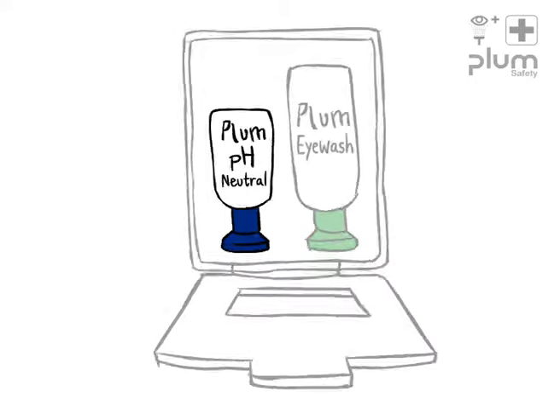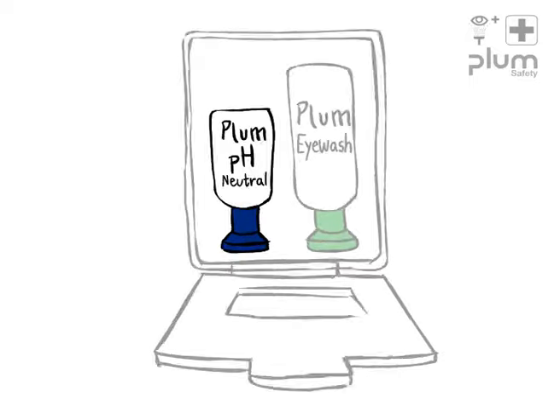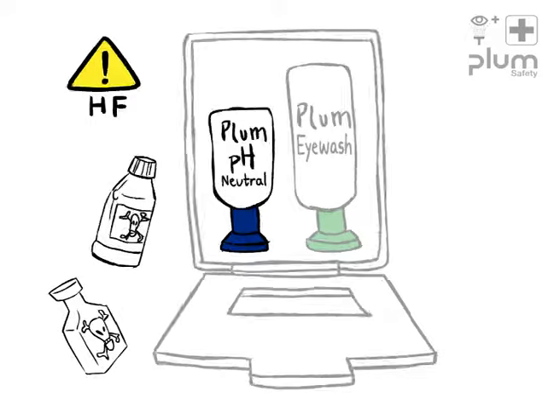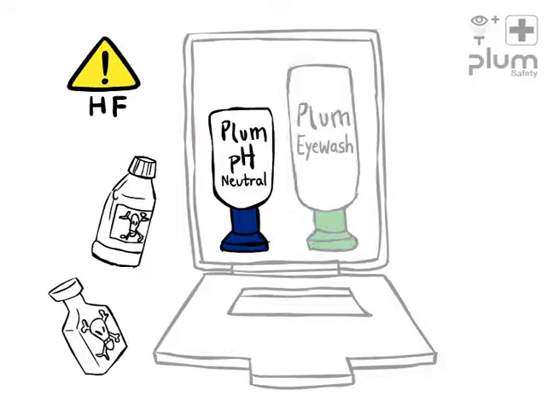The Blue Plum pH Neutral Eyewash is a neutralizing rinsing solution for accidents involving acids and alkali. Reservation is made for hydrofluoric acid — consult your safety engineer or Plum Safety.